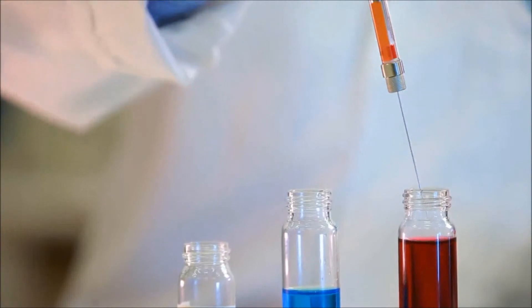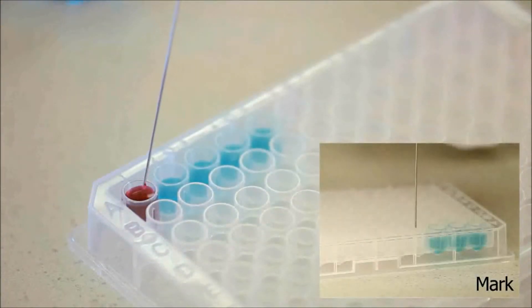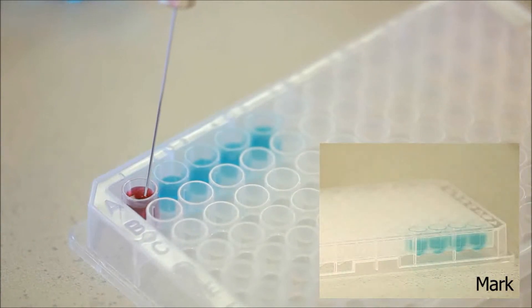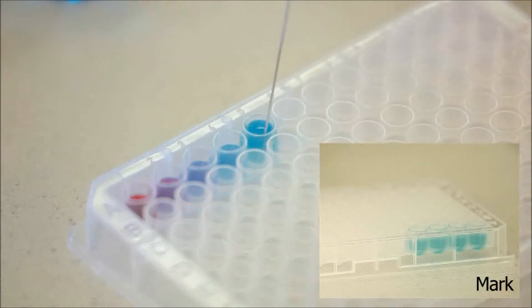The new solution needs to be mixed, so Catherine selects the mix operation, the mix volume, and the number of mix cycles. Then, Catherine dispenses the new solution.